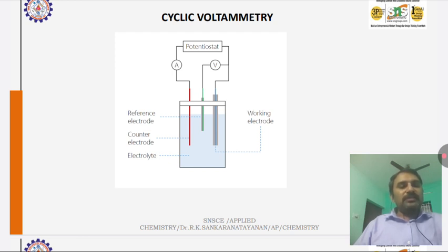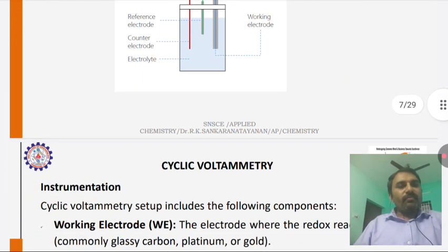Then we paste the sample, measuring 10 mg or 5 mg. We especially use a four-digit balance, so that we get an accurate weight.